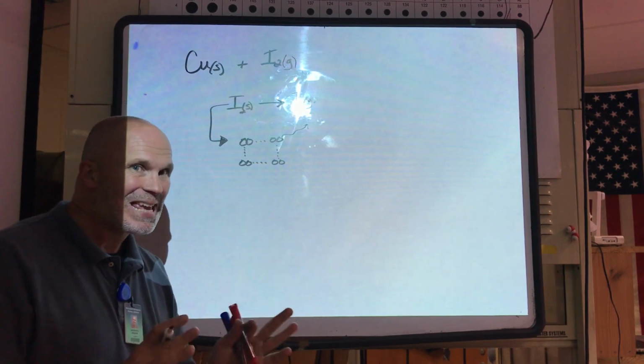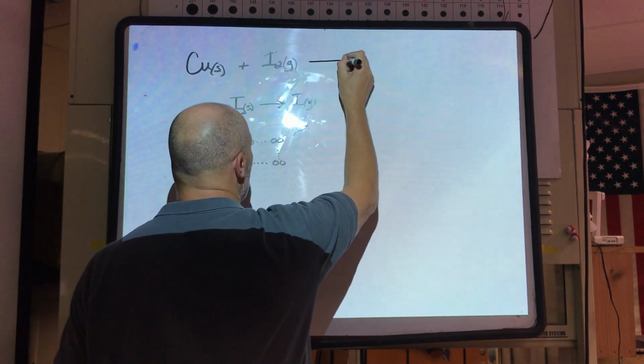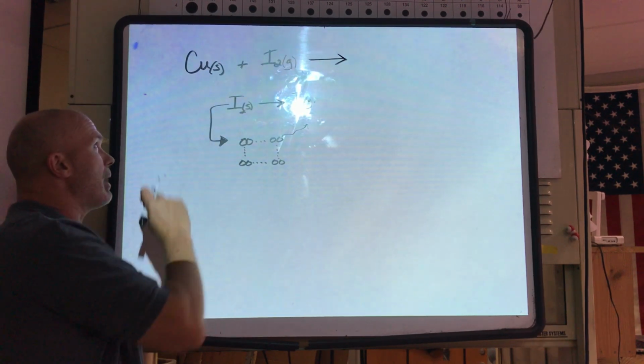We're actually going to heat the lab to drive it forward. We'll talk about that as well. So in any case, we have iodine gas that results from the sublimation. It's going to react with copper.